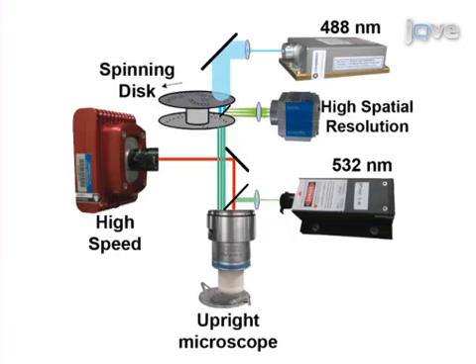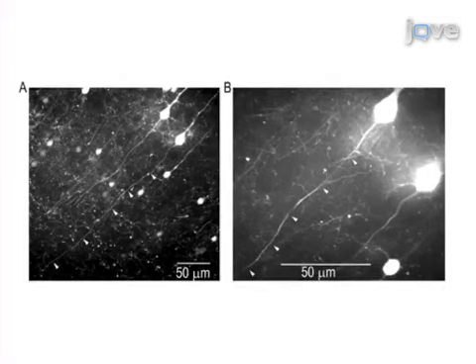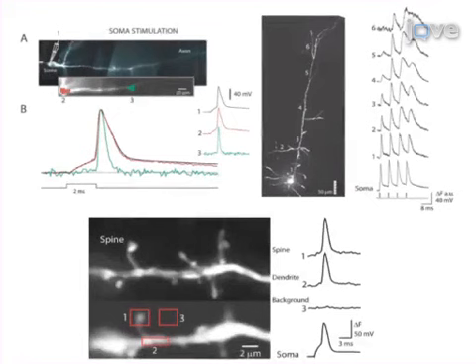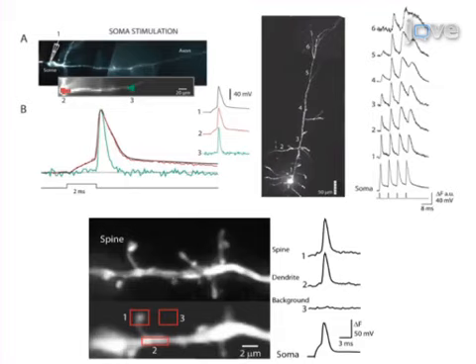Next, select the neurons with appropriate anatomy for effective imaging — neurons with long intact processes in a single focal plane close to the surface of the slice. Then load the pre-selected neurons with voltage-sensitive dyes to allow optical tracking of the membrane potential changes.